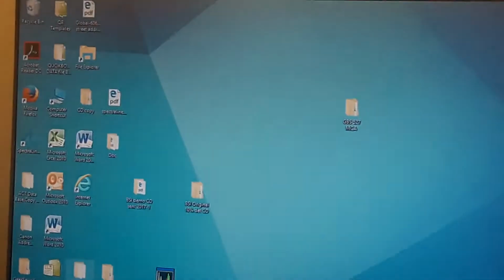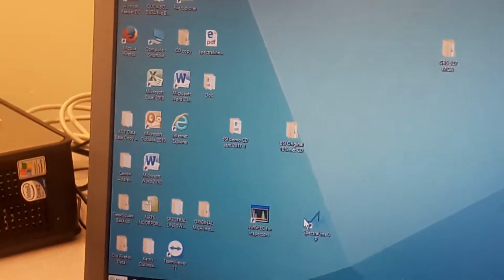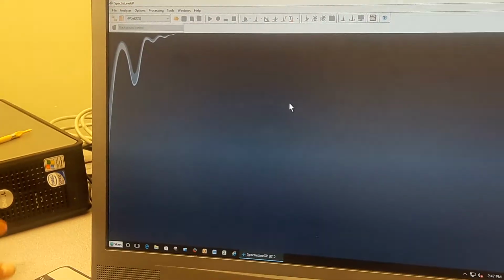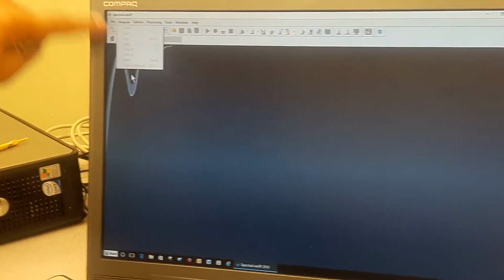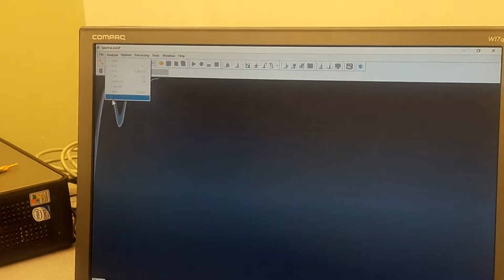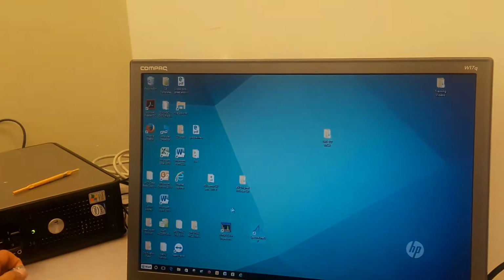install it. Now if you close your installation window, you will see that a shortcut icon has been created on the desktop if your installation has gone through, and if you click it open, it will show you this screen for the icon. Now it will not work because I don't have the dongle installed, so you can see that if I open the analyzer buttons in here, everything is whitened out. It's very important. Sometimes customers will call us and say, hey, I installed the software but I can't do anything. It doesn't let me control my analyzer. The reason it doesn't let you do anything is because you don't have the dongle installed or the dongle driver installed in here. Now to use the dongle, I will have to install the dongle driver.